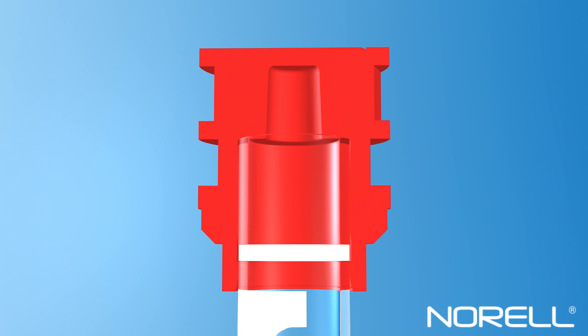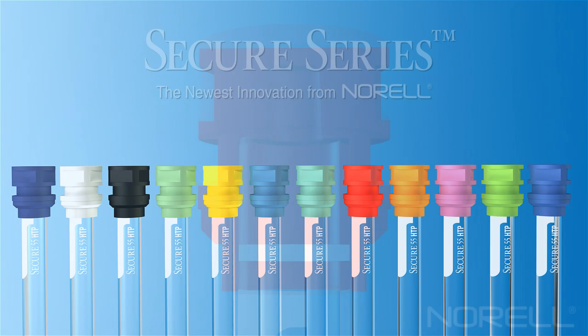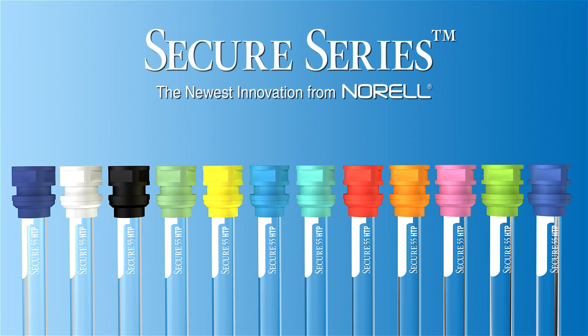Norell Secure Series NMR tubes, paired with the Norlock closure system, offers a superior level of sample containment and isolation, safeguarding the integrity of precious or critical NMR samples and assuring secure retention of the NMR tube in the spinner turbine.